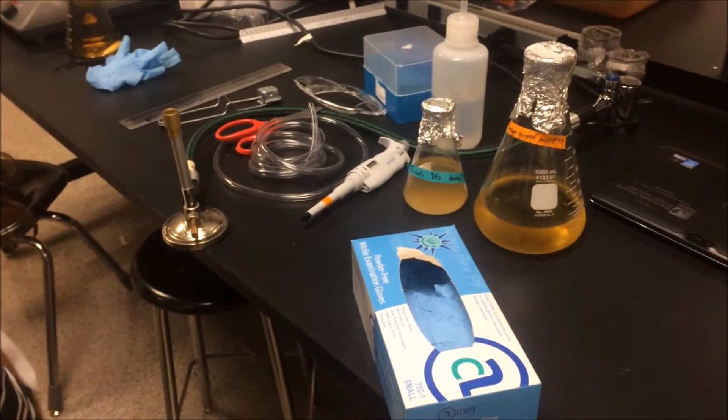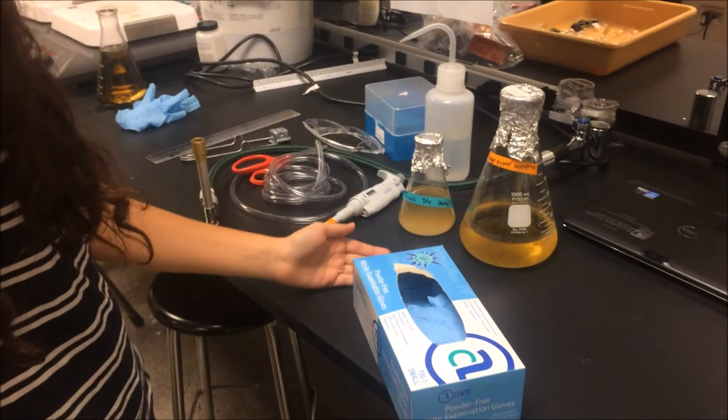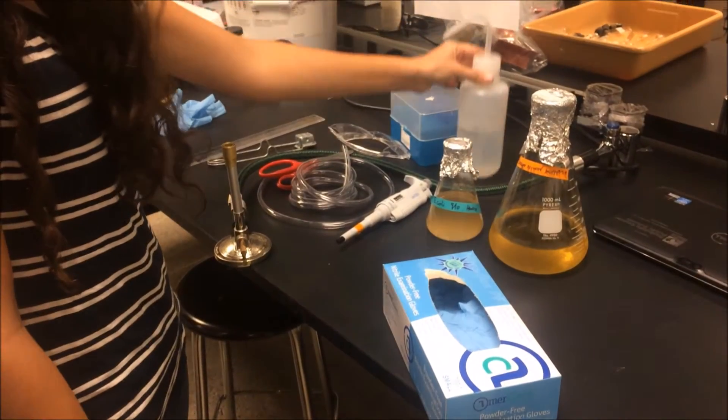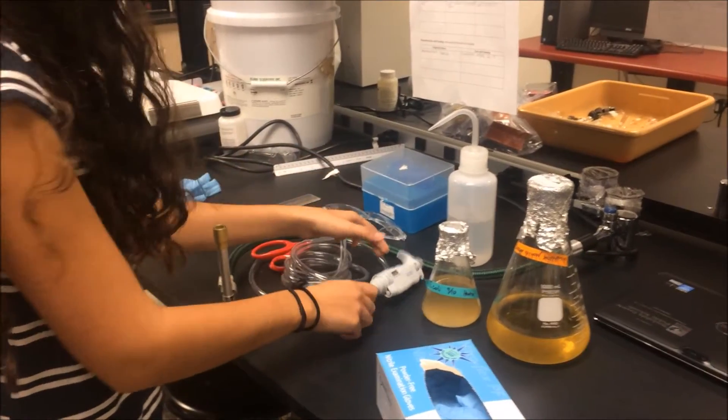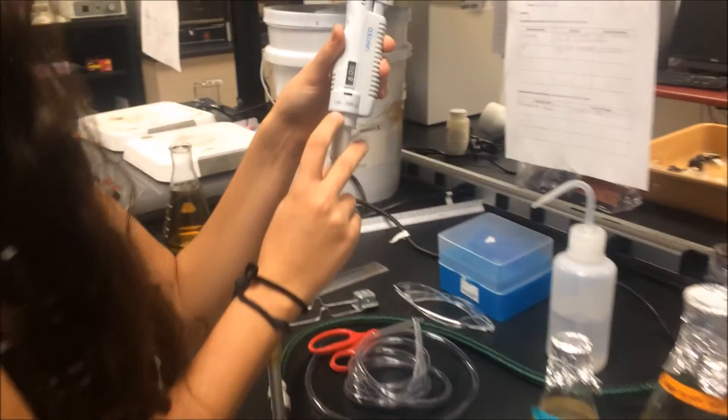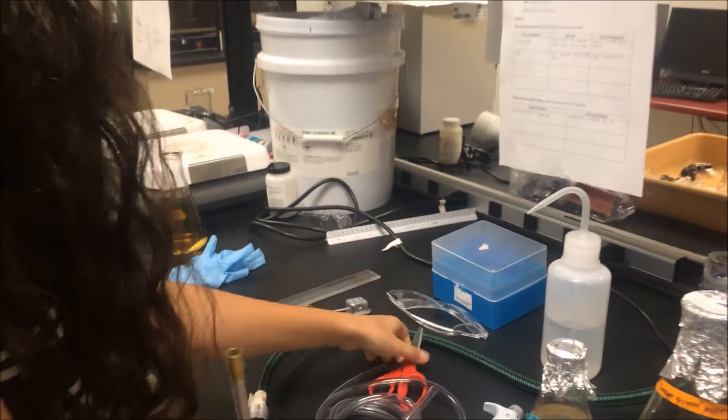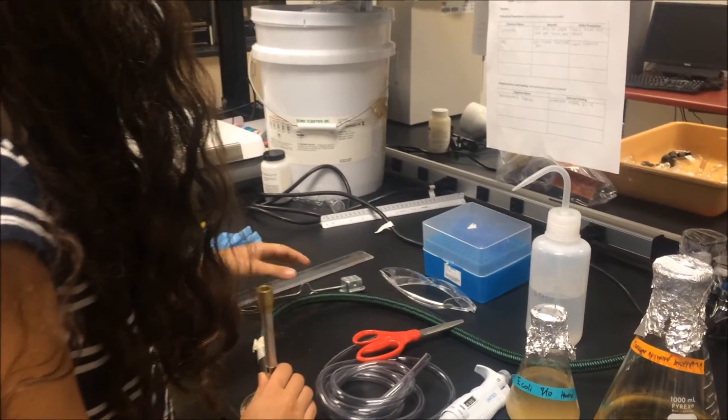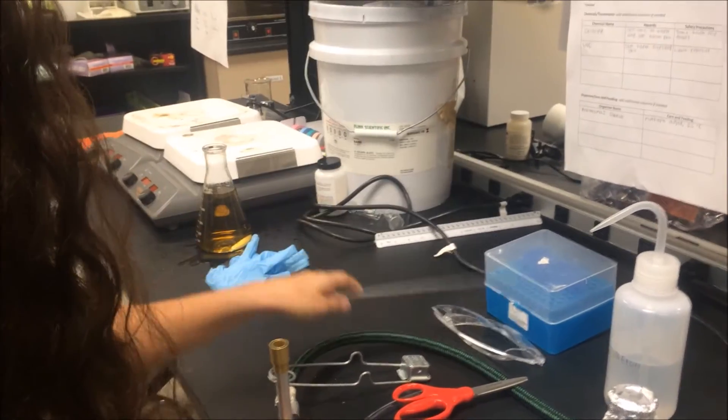First, gather all materials. Gather gloves, nutrient broth, E. coli, 70% ethanol, micropipet tips, micropipetter from 100 to 1,000 microliters, vinyl tubing, scissors, Bunsen burner, striker, ruler, and lab coat.